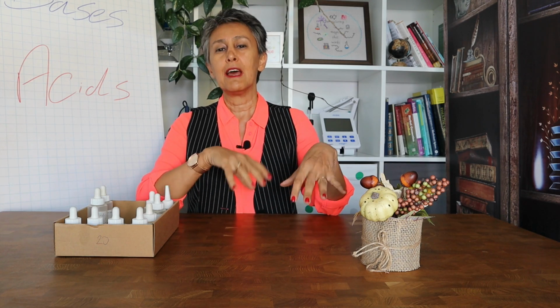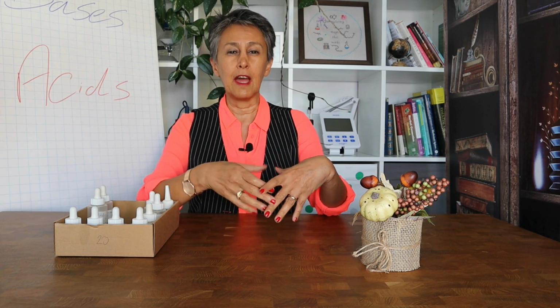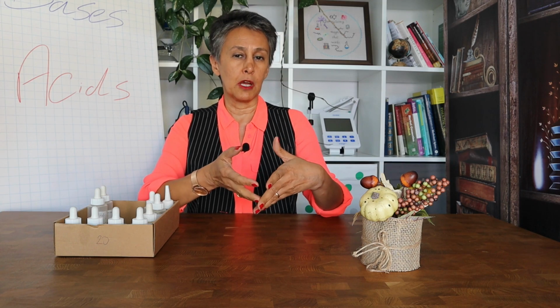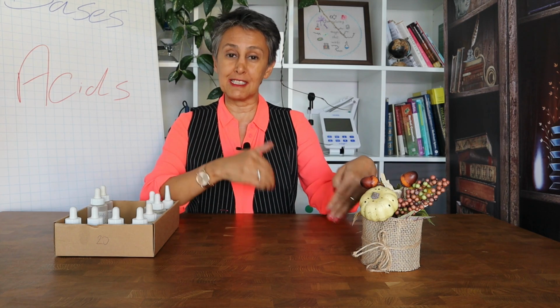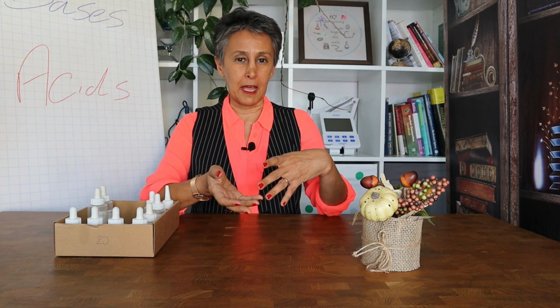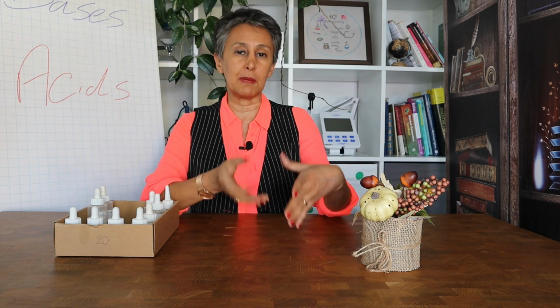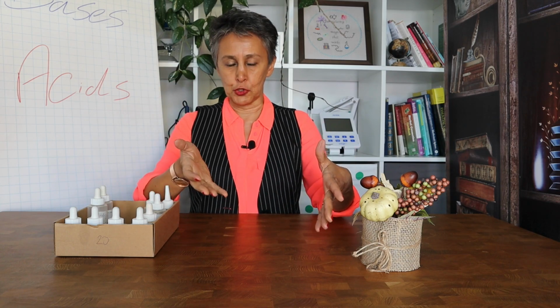So when you add a concentrated base or a concentrated acid, specifically when you are working with small quantities, with batches of about 50 to 100 grams, that 1 drop of acid or base is too much. And obviously you cannot put half of a drop or reduce a drop to a half. So we need to work another way. But first, let me tell you why we need to reduce or increase the pH of a cosmetic formulation at all. Come with me to the computer and I'll explain to you.